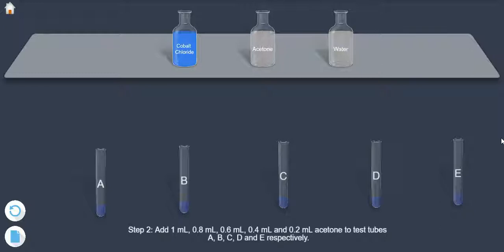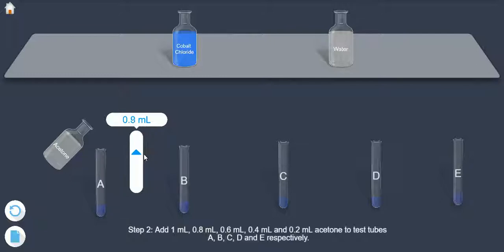Add 1 ml, 0.8 ml, 0.6 ml, 0.4 ml and 0.2 ml acetone to test tubes A, B, C, D and E respectively.